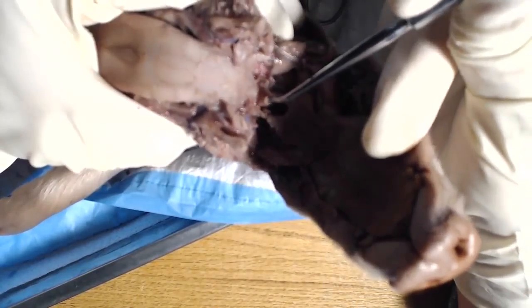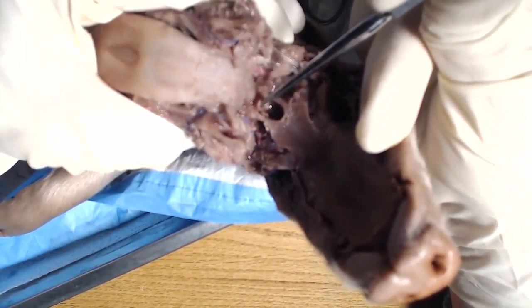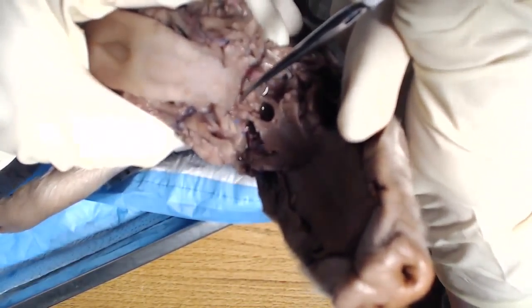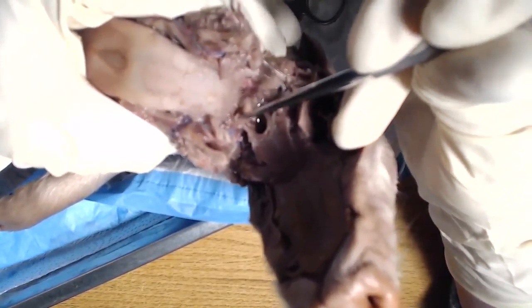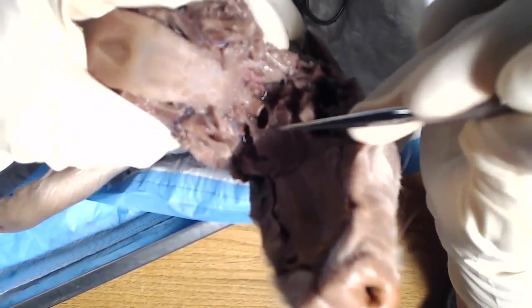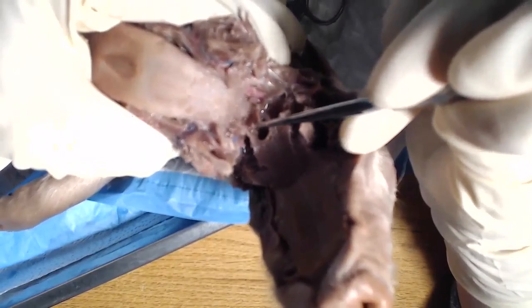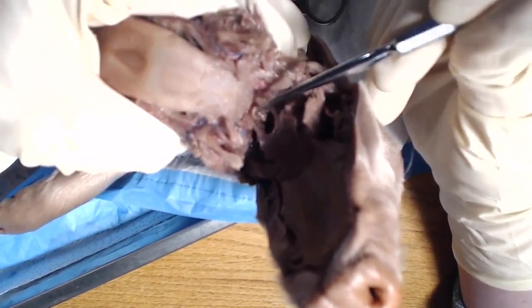Now if you pull the esophagus forward this way, oh, I'm sorry, if you pull the epiglottis towards your tongue, you might be able to see two little folds there, and that's your larynx. So that's your airway, and that's what your epiglottis is protecting whenever you swallow.